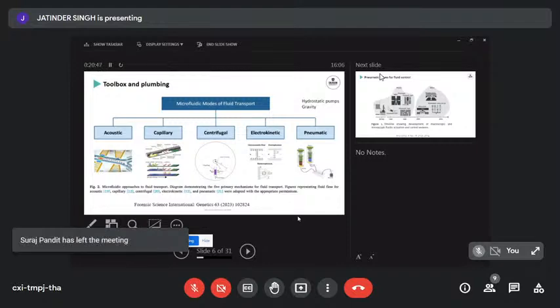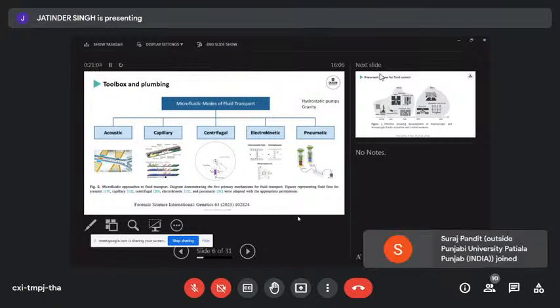We've got a fair few options in microfluidics to pick for our fluidic transport. They're sorted alphabetically here, so not quite in order of reference, but we've got acoustic systems where we can use sound waves to move particles, and if we move particles, they directly drag the liquid along, and we can therefore use acoustic waves. We can use sound to move liquids around.